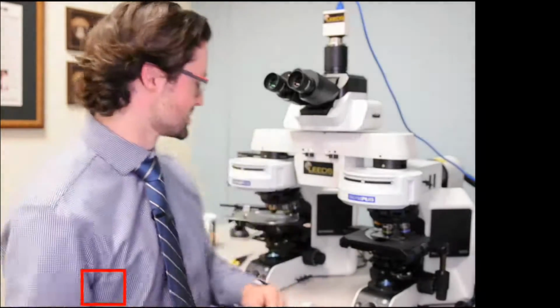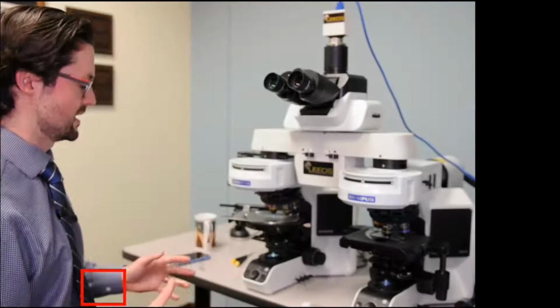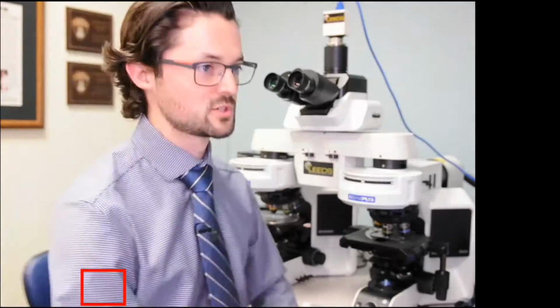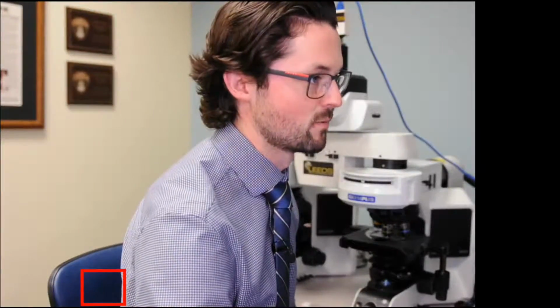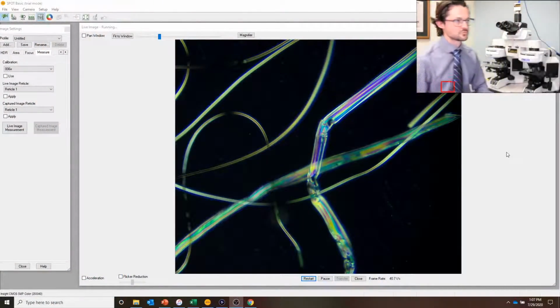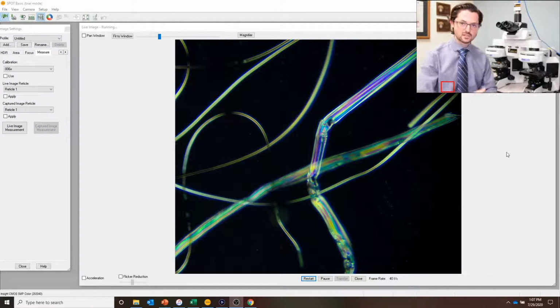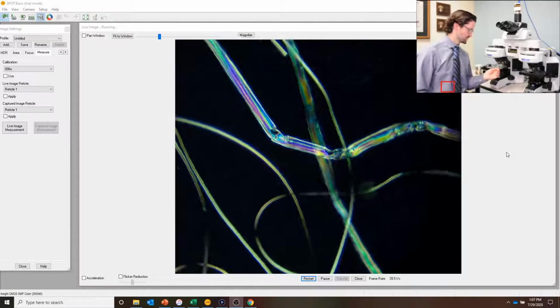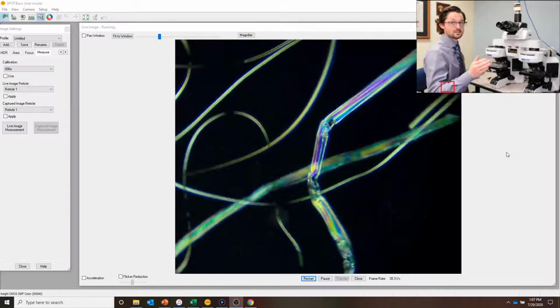Let's begin. The microscope you see behind me is an LCT system, and let's switch over so you can see what I'm looking at. This is a view through the software of our specimen in cross-pole. The goal of objective and stage centration for polarized light stages is that when you rotate them, it stays locked in.